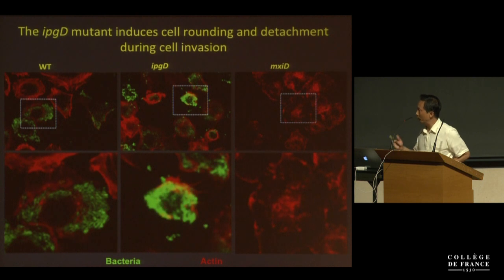And what happens over infection? Of course, you might wonder why the cells do that. Why does it want to confine calcium responses? We believe that this modulation at the entry site is probably also important for membrane processes, like proteins involved in cytoskeletal organization. But here we looked at long-term, prolonged kinetics of infection.